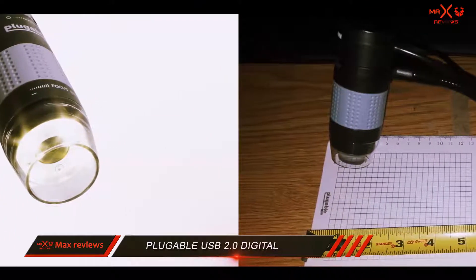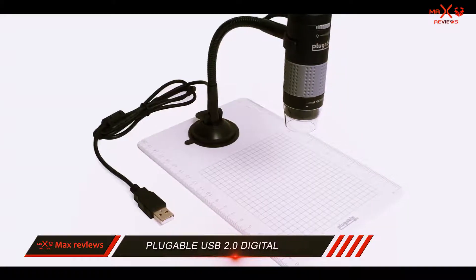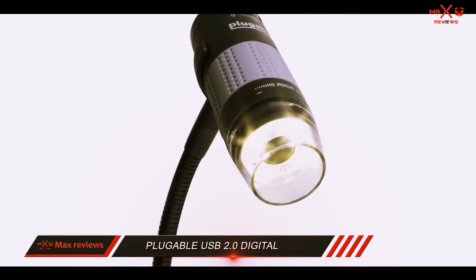Moreover, there are two ways to take a picture with the Plugable USB 2.0 Digital Microscope. Firstly, you can press the Take a Photo button on the computer software.